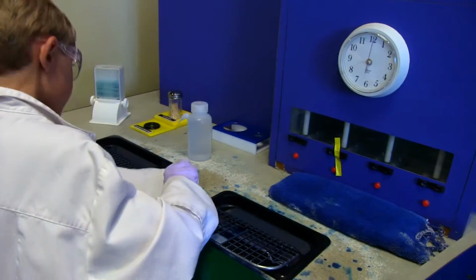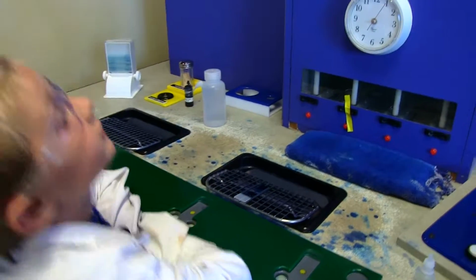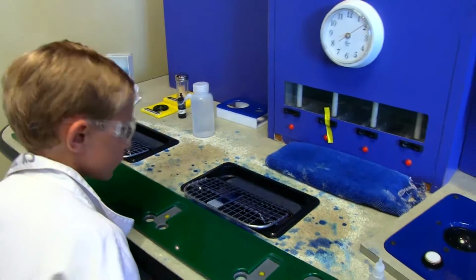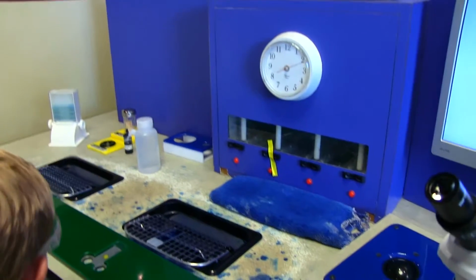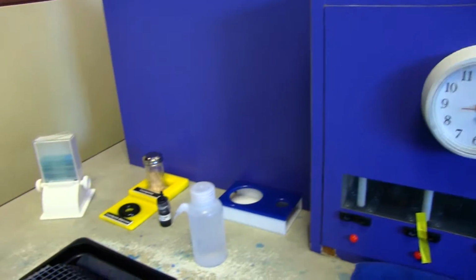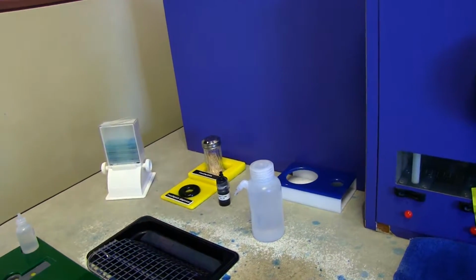Let the cells absorb the stain for 60 seconds. The methylene blue is the dye which stains the different cell components, such as the nucleus, cell membranes, and compartments, a dark color. If you didn't use the methylene blue stain, your cells would appear colorless under the microscope.